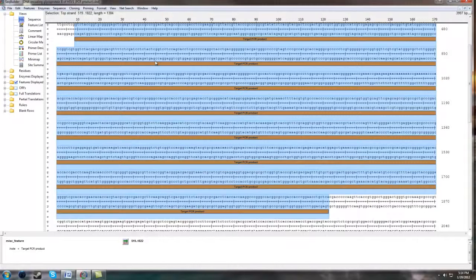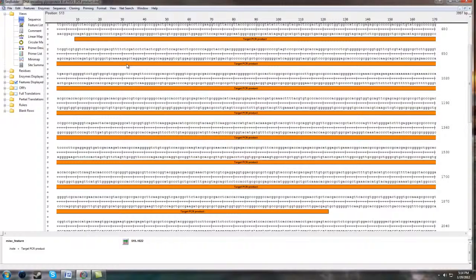I'm not going to talk about what PCR is and the background information, because I'm going to do another video on different molecular biology concepts, and PCR is going to be one of those topics. This is going to be completely straight and to the point on how to design primers for PCR. Of course, you know that we need two primers for a PCR reaction to work, a forward and a reverse. So how do we actually do that? Well, it's actually quite simple.